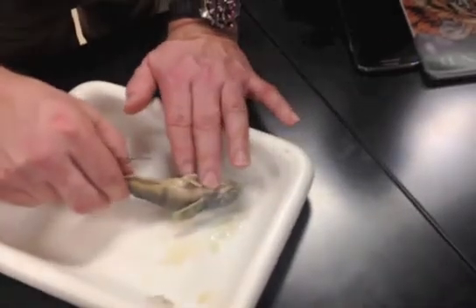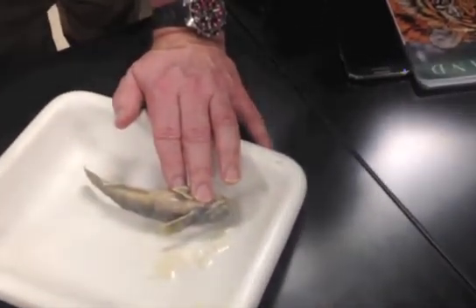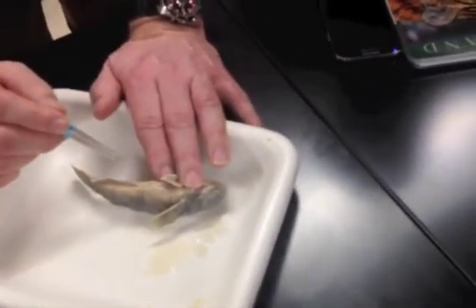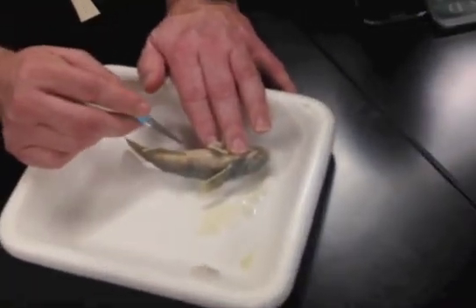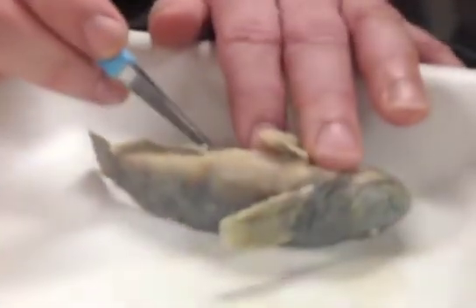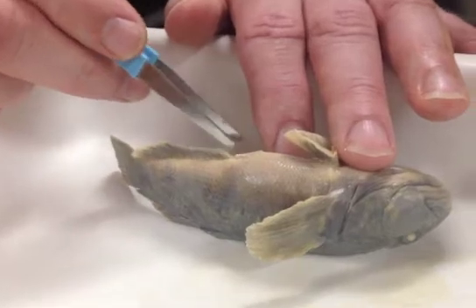The next part is to identify whether it's a male or female. Males will look like a hot dog — they usually have a track that goes from their anus, right here, to the anal fin. This is actually a female, because it's not long enough.